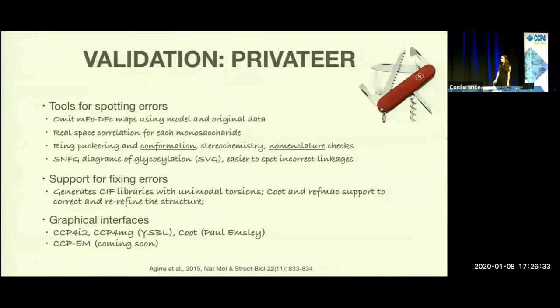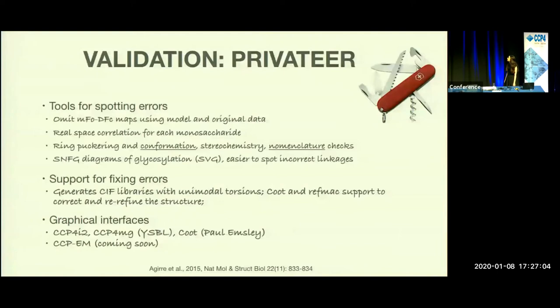Now I'm going to tell you more about Privateer, which is software for sugar validation. It has several tools for spotting errors: it generates mFo-DFc density maps, calculates real-space correlation coefficients for each monosaccharide, and has ring puckering conformation, stereochemistry, and nomenclature checks. It generates SVG diagrams for glycosylation, which makes spotting linkage errors easier. It also generates restraint libraries with unimodal torsions, which can be used in COOT and REFMAC to correct and re-refine a structure. It's currently integrated in CCP4I2, CCP4MG, and COOT, and soon it will be coming to CCPEM as well.